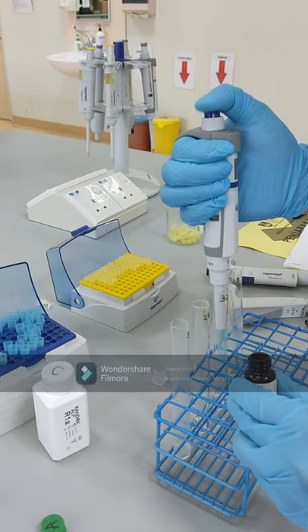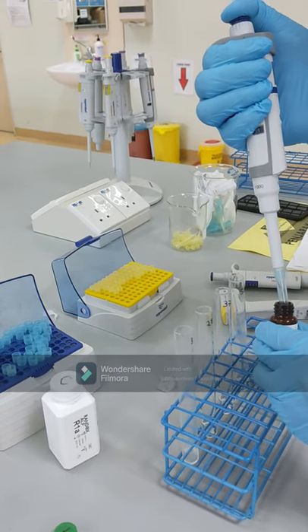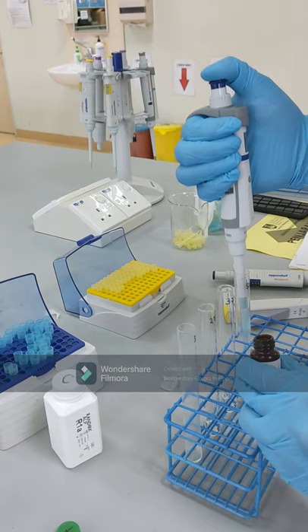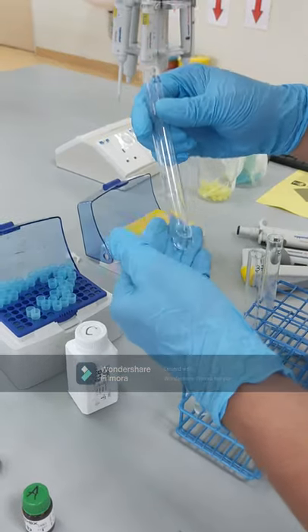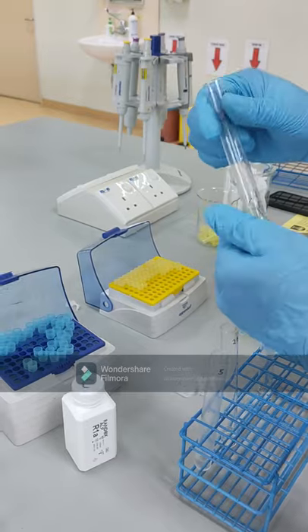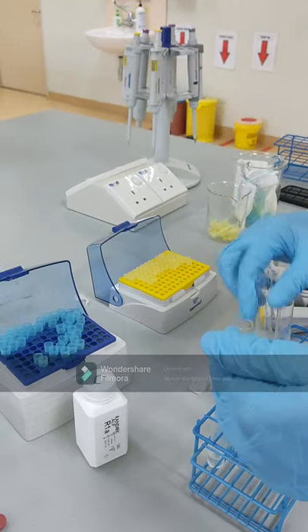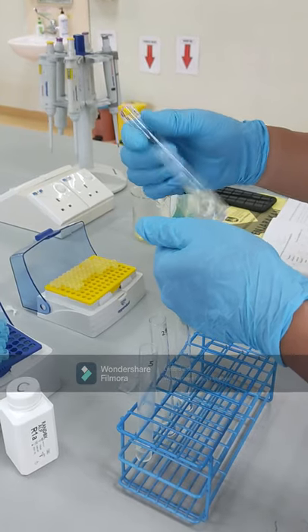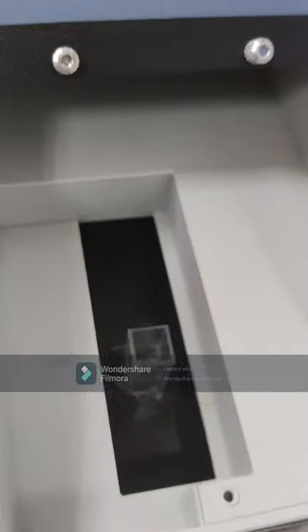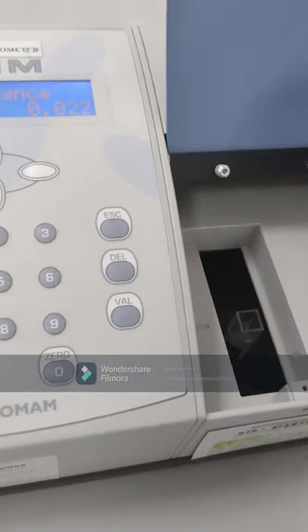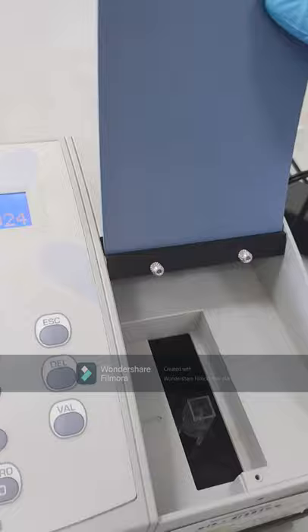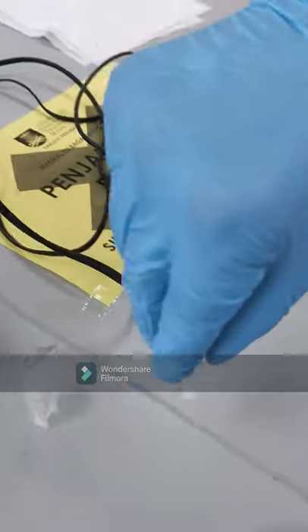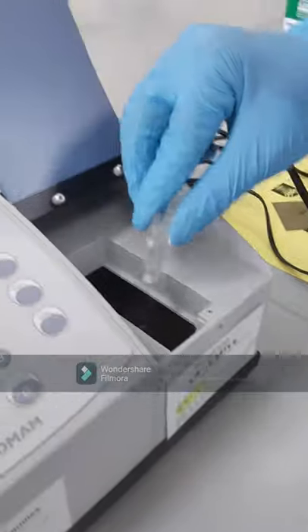Remember to take the absorbance reading at 0 minutes. Each test tube already has a reaction proceeding at a different rate. We are mixing by tapping gently the test tube, and then we are ready to take the absorbance reading at 0 minutes. For the spectrophotometer, we need to blank once. Then we will take the reading at 0 minutes. Because we have many cuvettes, we can incubate the reaction for 5 minutes in the cuvettes themselves, or you can return them to the test tube. After 5 minutes, you need to read again.